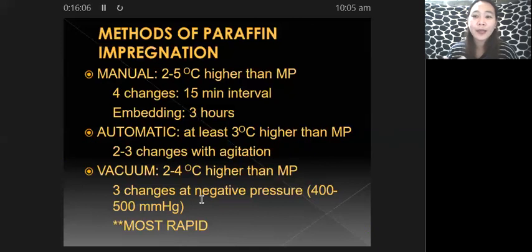Once your two-way needle is inside your evacuated tube, and the other needle is inside your vein, blood will automatically flow into your evacuated tube. This is because of the presence of vacuum inside your evacuated tube. It will aspirate or suck the blood automatically into the evacuated tube. So it's the same principle that is involved in your vacuum impregnation or infiltration.